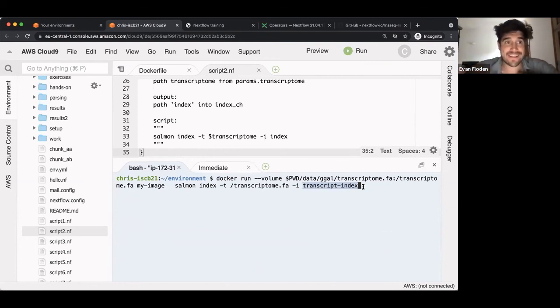The container shuts down at the end of that, and that file is lost. Containers are immutable in the sense that every time you start them up, they begin in the exact same state they were built in. So they're guaranteed this reproducibility, but it means that anything you build or run in them is lost as soon as that container's gone.